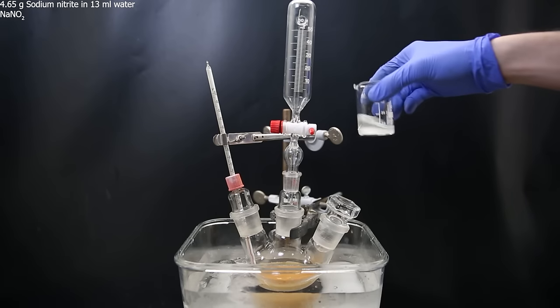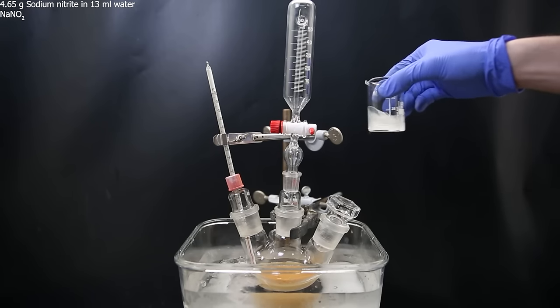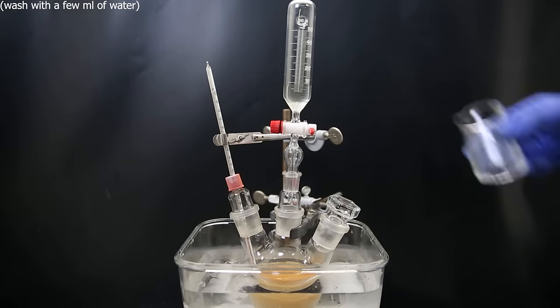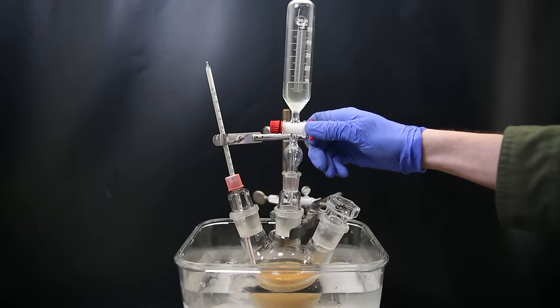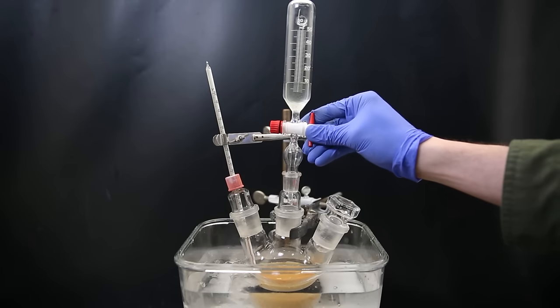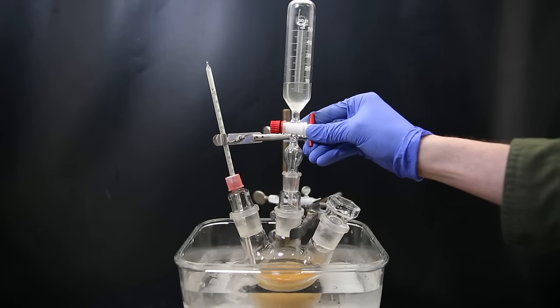I dissolve 4.65 grams of sodium nitrite in 13 mL of water, and then add that into the dropping funnel. I add the sodium nitrite solution slowly to the flask, and keep the temperature around 0 °C, because this reaction is also exothermic and temperature sensitive.